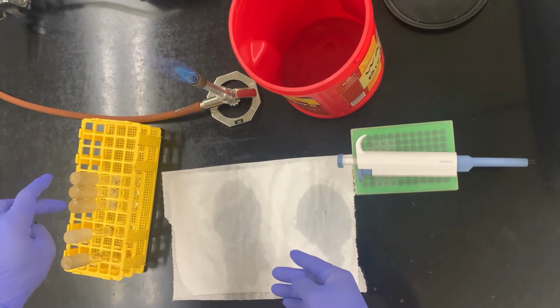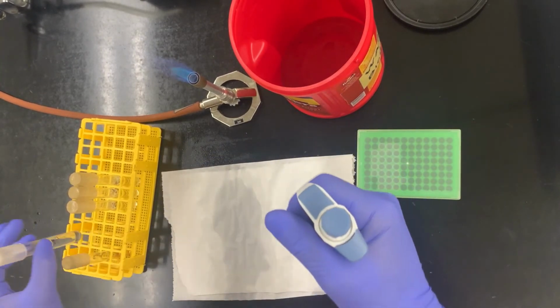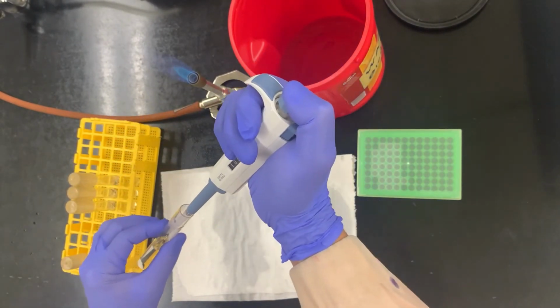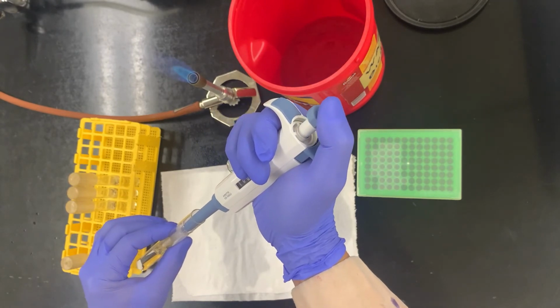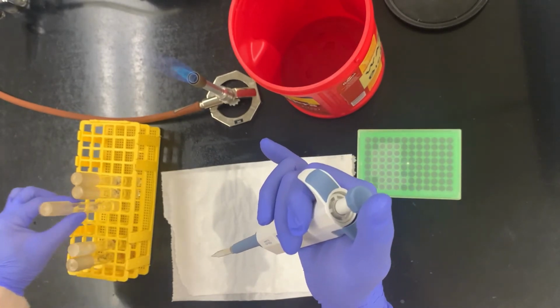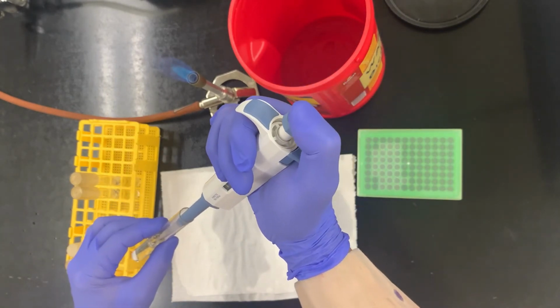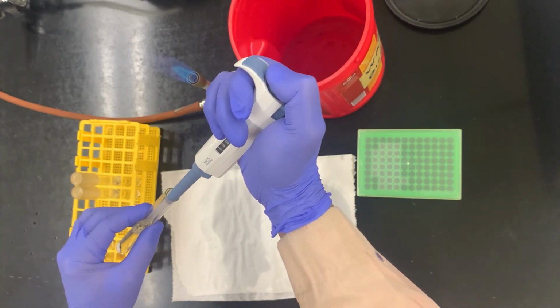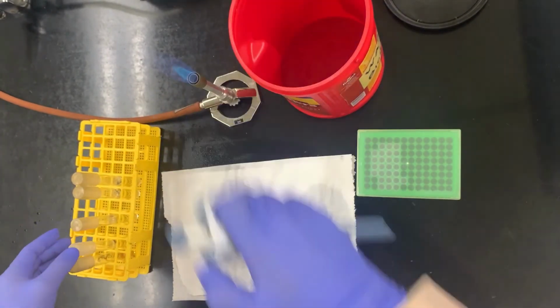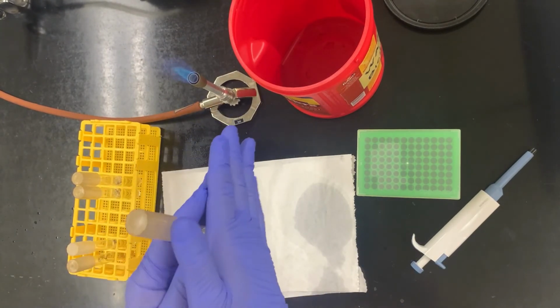I'm ready to now do my second dilution. So we're going to repeat the process. Grab a tip, grab my 10 to the minus 1, twist and pull, flame. First stop, into the liquid, nice and slow, flame. I'm going to put that over there. I'm going to grab my 10 to the minus 2. I think you know what I'm going to do next. Nice and slow to first stop, second stop. Make sure you pull out before I let go now, and done. Discard. Mix well. You repeat this process over and over again.